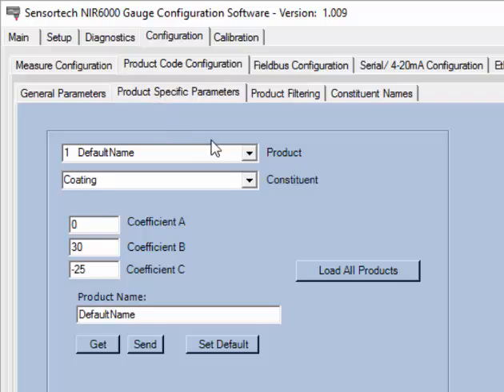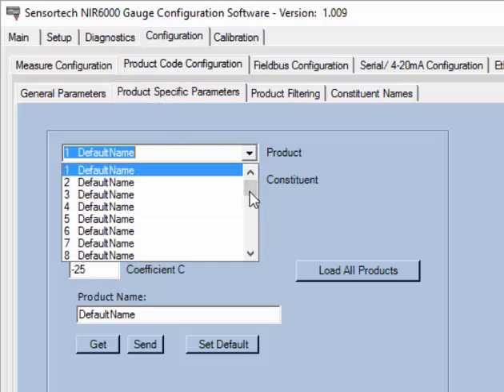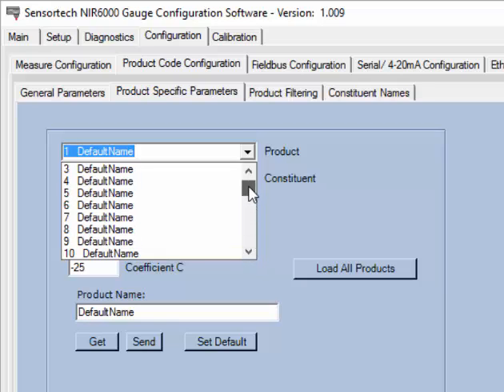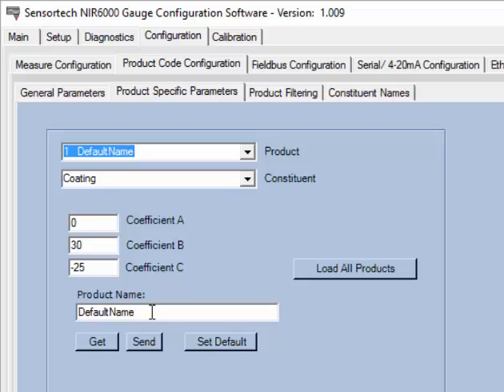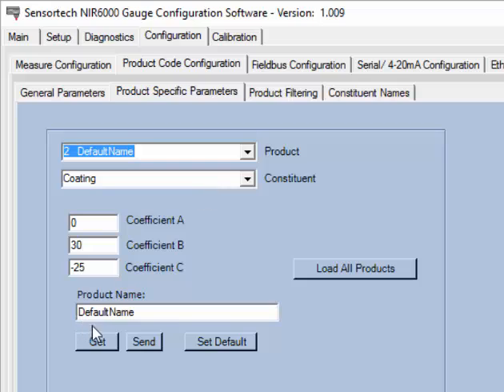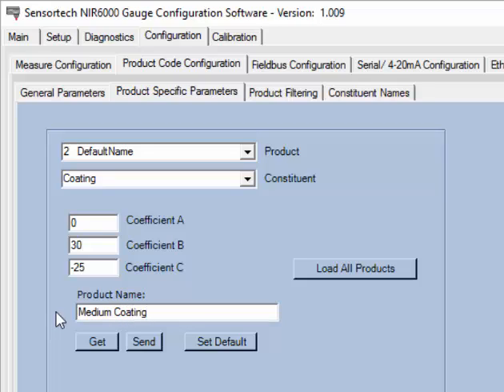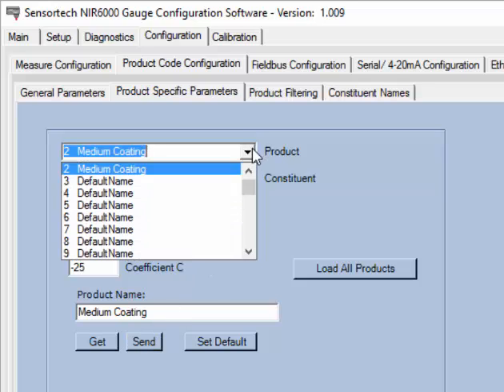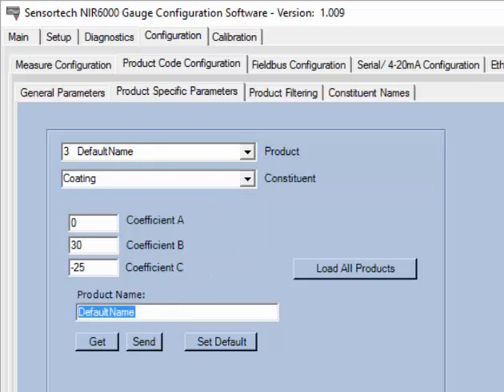Setting product or calibration codes is a simple task and you may do this in the Product Specific Parameters tab located next to the General Parameters tab. Note that every NIR Series Analyzer is equipped with 50 product codes and you can set these from the Product drop-down menu. For this example, we will set three product calibration codes: Light, Medium, and Heavy Coating. We will call the first product code Light Coating and enter this in the Product Name field, then select the Send button. Now we will set Product Code 2 as Medium Coating and Product Code 3 as Heavy Coating. Coefficient B and C are the calibration coefficients for each of the product codes. We will change Coefficient C for each of the product/calibration codes so that we can see the difference when we switch between the different product calibration codes. Note that you must send all changes before selecting a different product code.